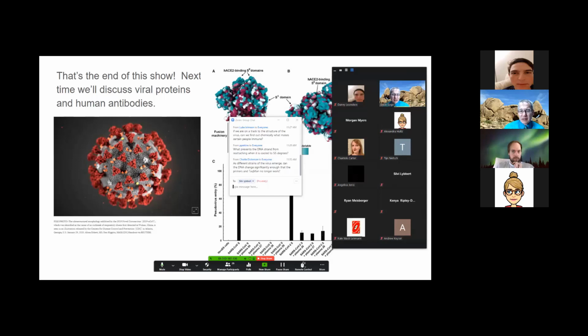So it is possible for the mutations to make it so your primers don't work. And that's one of the reasons they amplify 3 different sections of DNA. We're not just relying on one primer to work. We're saying if primer 1 doesn't work, how about primer 2 or primer 3, which are in different sections of the viral genome.